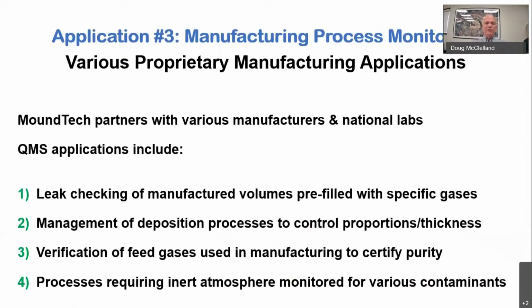That's very popular. Again, the deposition process control, that's something that we see very often as an application for the mass spec. Verification of feed gas is used. So we want to verify that the feed gas into the process is of the right purity and so on.